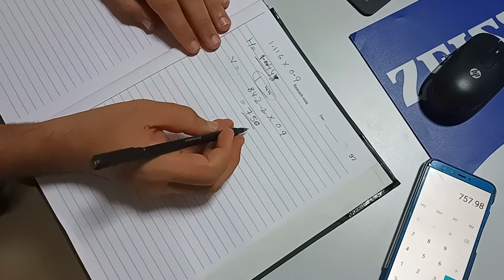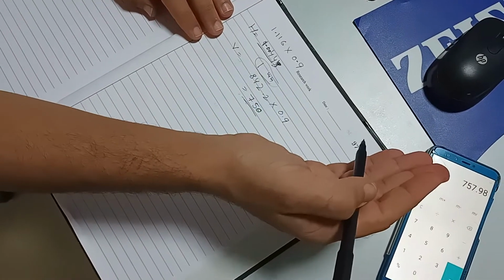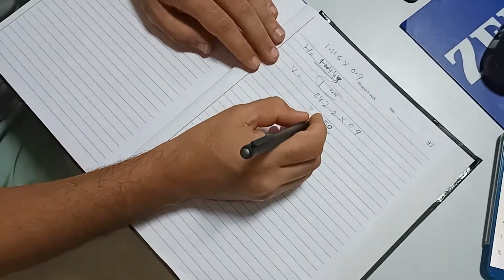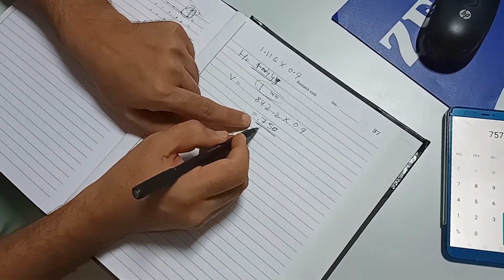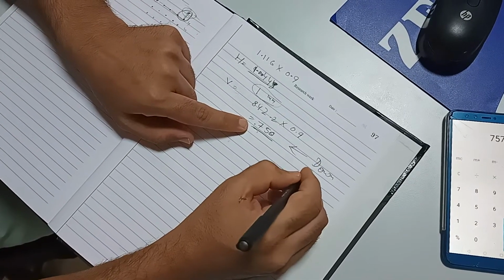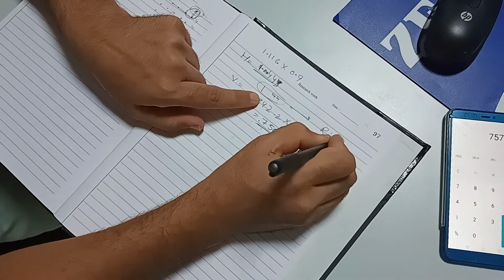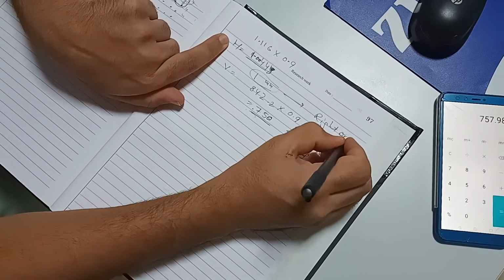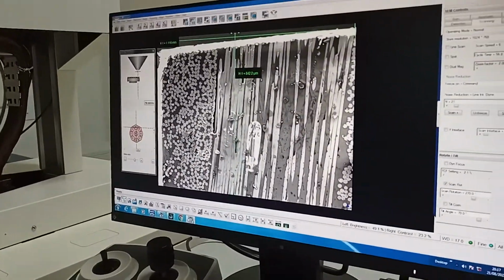More overlap means less than 90%. So 750 micron or 0.75 mm we will keep. So this is vertical. Remember, this will be required in down and up, and this will be required in right and left. These are the x values, right or left. Now we will go to the next exercise.